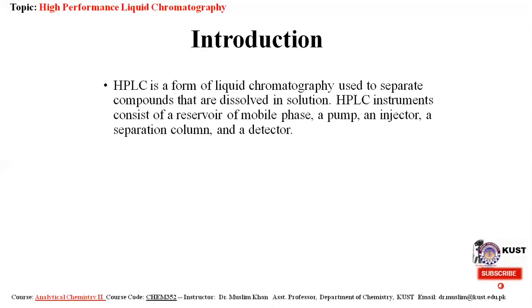So HPLC is a form of liquid chromatography used to separate compounds that are dissolved in a solution. Basically, HPLC is an example of liquid chromatography.